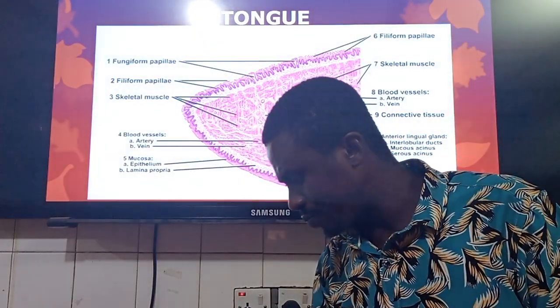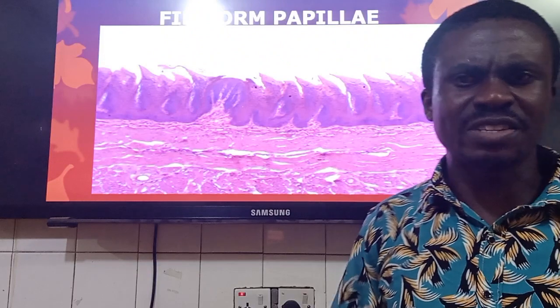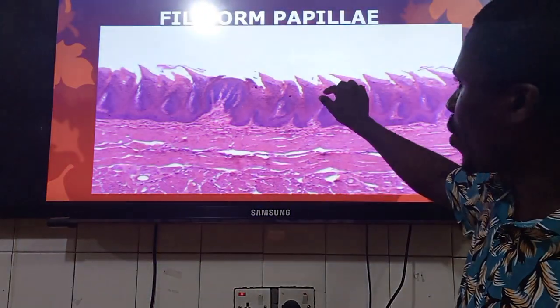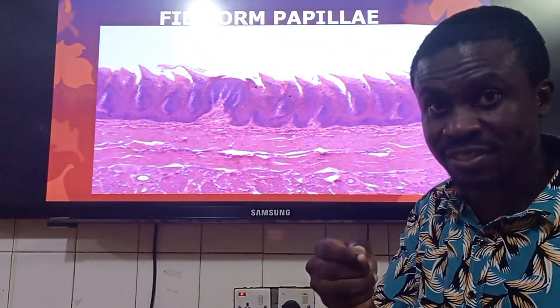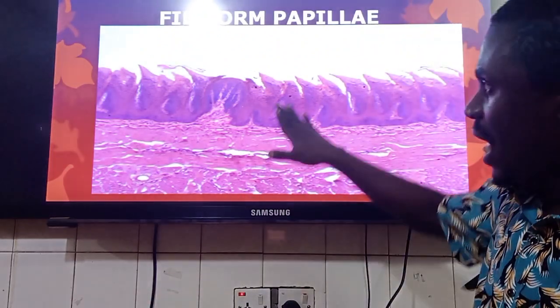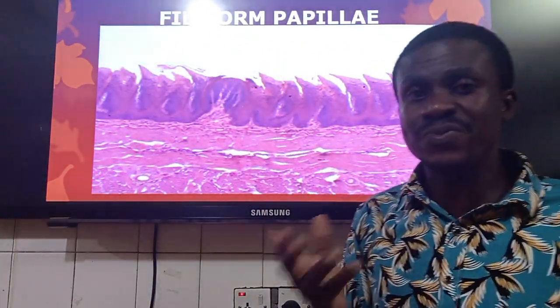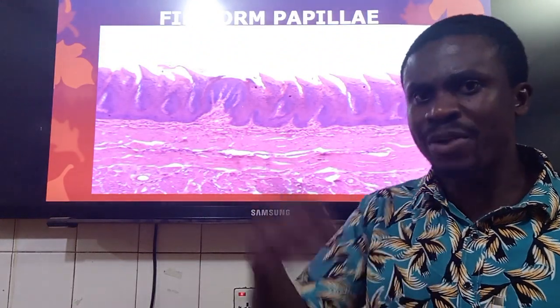That's for the tongue. And my friends, going on with the tongue again, you can be given the slide, for instance, to identify it. And my friend, the main thing I want you to know over here are the conical or slender-like structures which represent the keratin projections found on the anterior two-thirds portion or the dorsum of the tongue. And so if you flick your tongue out, those white spots that you find over here are histologically identified as such. So these are the guys. And one thing that we find is that in between these whitish areas, you'll be seeing some red dots over there.